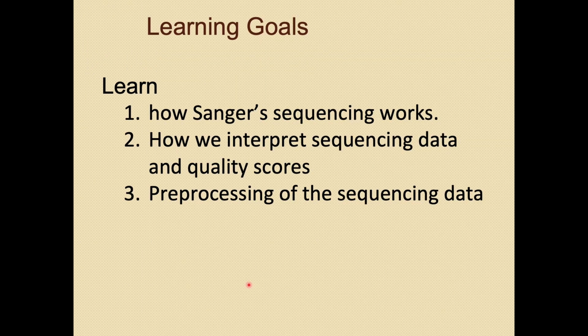Our goals today are to understand how Sanger sequencing works, how to interpret sequencing data and quality score, and how to prepare sequencing data for analysis. These skills are foundational for bioinformatics.